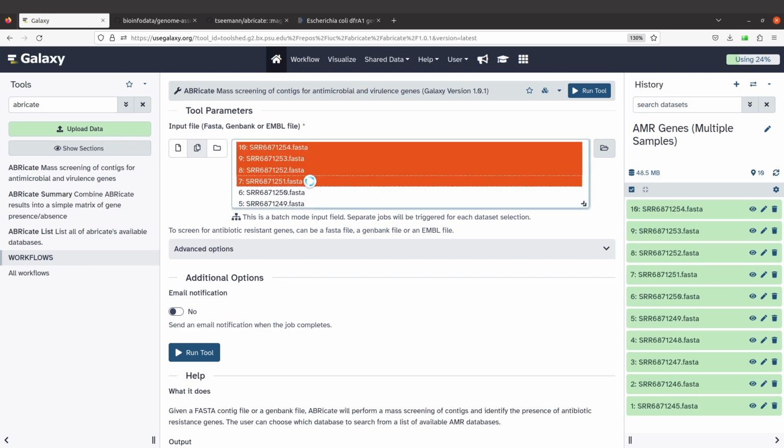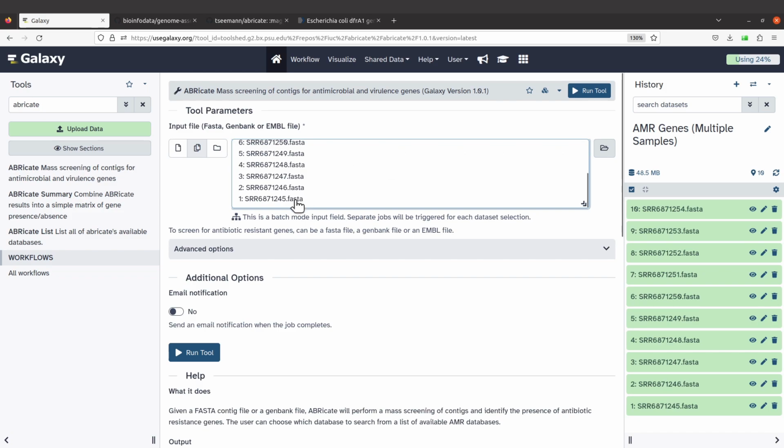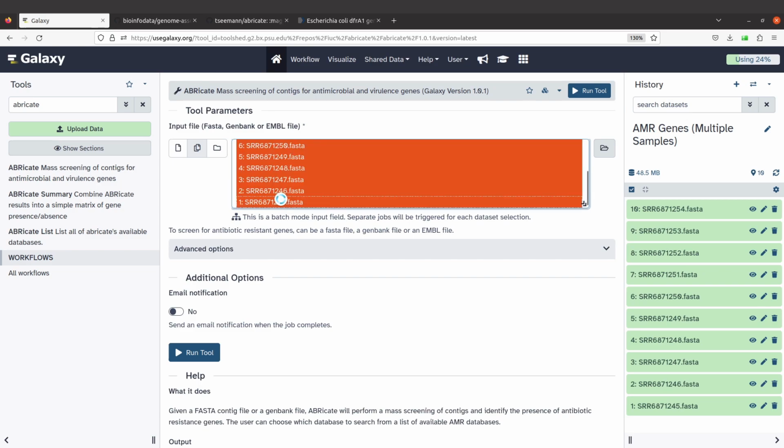All right. And then do it. But that can also delay. So just keep it simple. Just click on the number 10, this very top one here. Then scroll down to this one here, number 1. That's the first one here. So click it so that everything is highlighted.